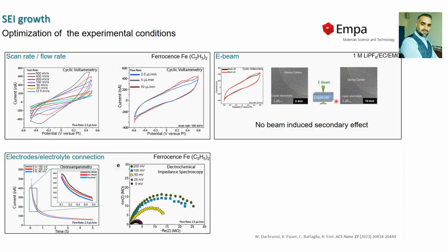Here we have the scan rate optimized, the liquid flow rate also, and we checked the electrolyte connection and the resistivity at the interface using impedance spectroscopy.